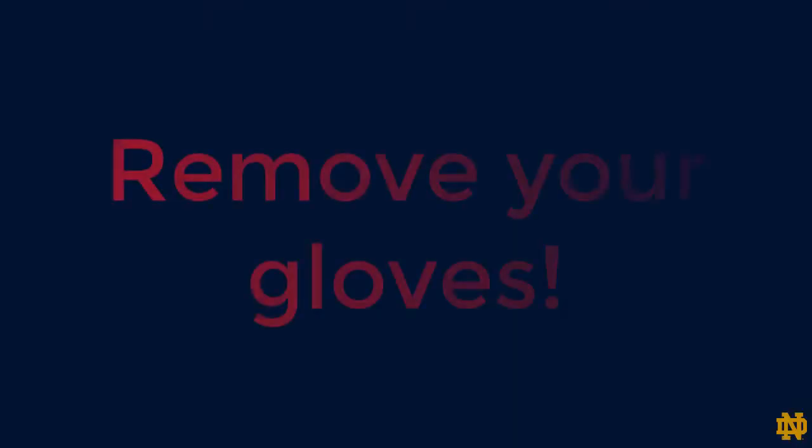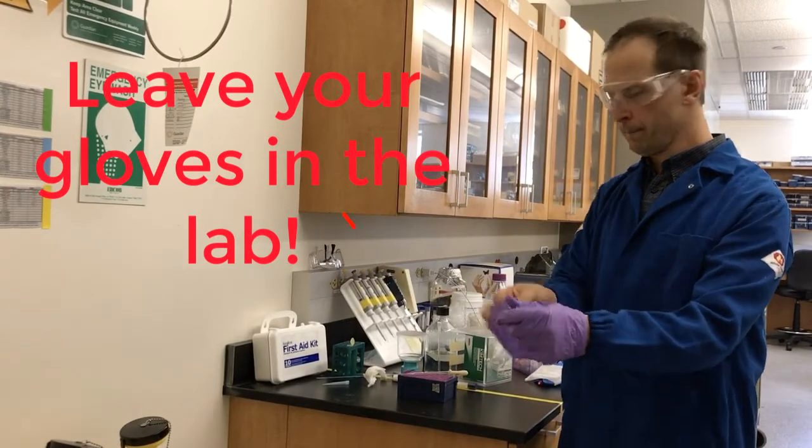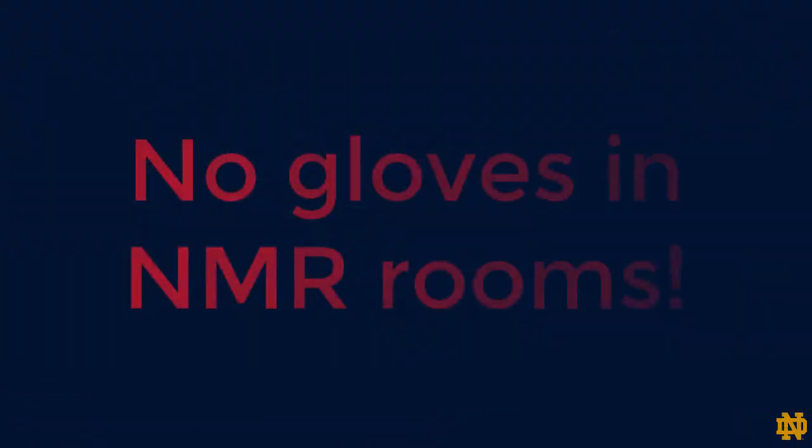Next step is to remove your gloves. Gloves must stay in the lab because they may carry a residue of chemicals. Remember, gloves are prohibited in all NMR rooms.